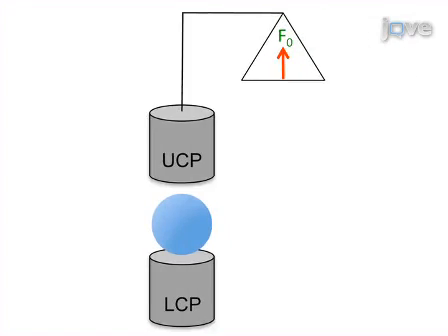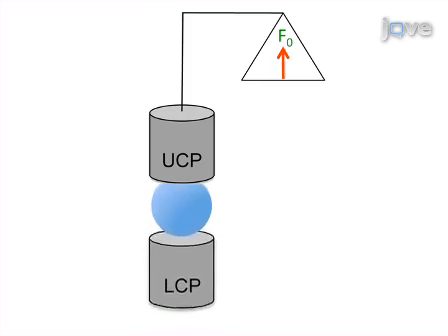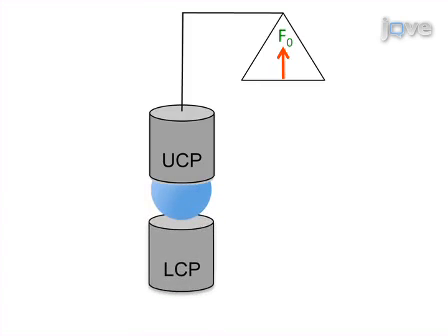Then, the upper compression plate is connected to a nickel-chromium wire, which connects it to the electrobalance and establishes a zero baseline weight referred to as F0. The experiment is initiated by raising the lower compression plate until the aggregate becomes compressed between the lower and upper compression plates, and is terminated when aggregates reach shape and force equilibrium, or FEQ.